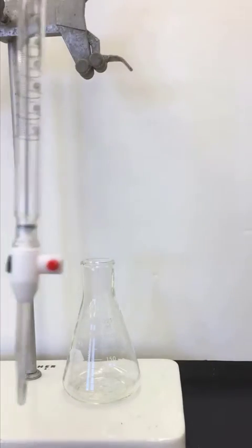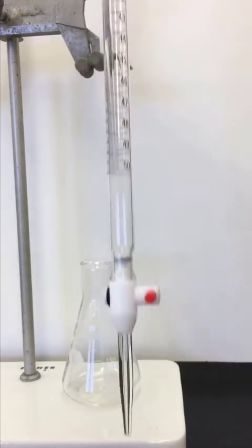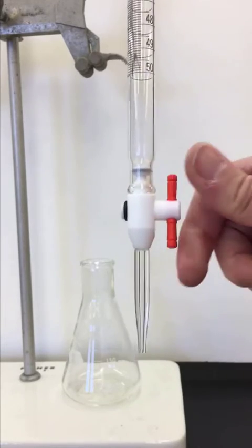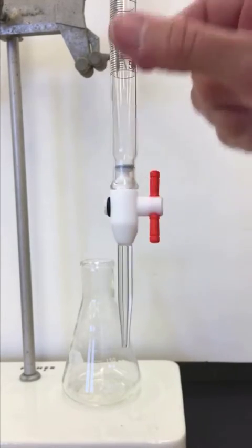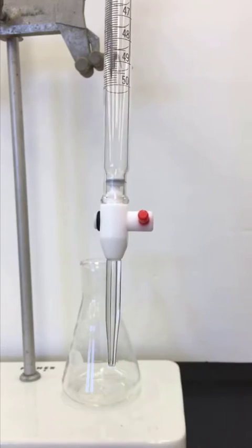The burette has a stopcock on the bottom here and we control the stopcock by turning it. When it's parallel with the burette it's wide open. When it's perpendicular it is closed.